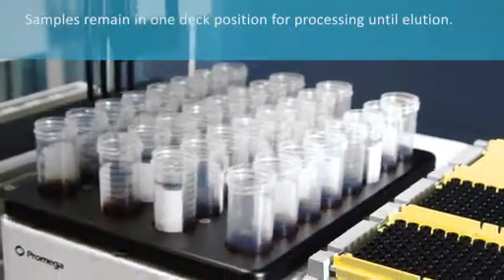Large-volume reagents are rapidly added using fixed tips. Samples remain in one deck position for processing until elution.